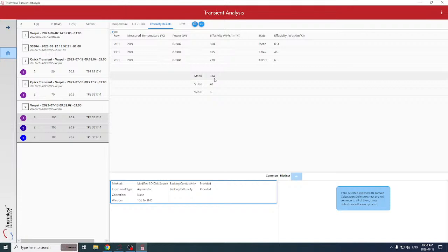So I hope that it describes a little bit in terms of the new ISO and the two uses of it. Of course, the one-dimensional shape being a more widely used part of that -7 standard, and certainly much more popular because elongated materials are very common. And so to be able to measure an isolated one-dimensional shape has several advantages. Isolation, heterogeneity, even directional properties. So if you take an anisotropic sample and take out cores in each direction, you can say that you're measuring an isolated direction for that anisotropic sample. So it has advantages, for sure.